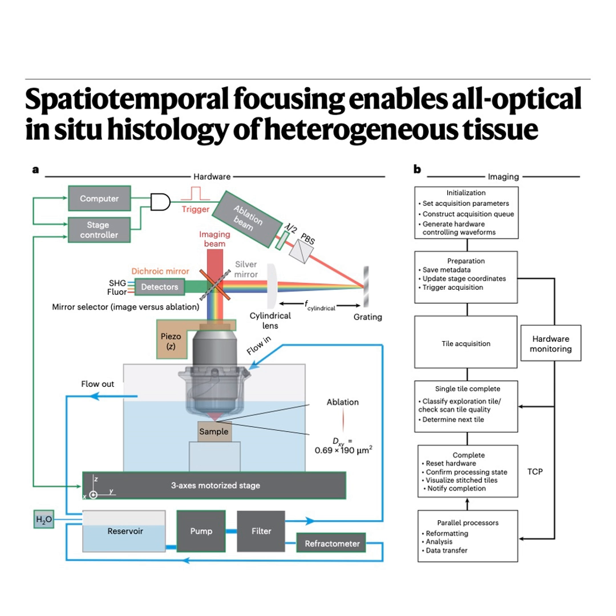The official term is plasma-mediated ablation. Ablation just means material removal. And because that plasma is confined to the tiny, diffraction-limited focal volume of the microscope, the material removal, the cut, is done with the absolute highest possible precision. We're talking diffraction-limited precision. The cut is literally as fine as the microscope can resolve.